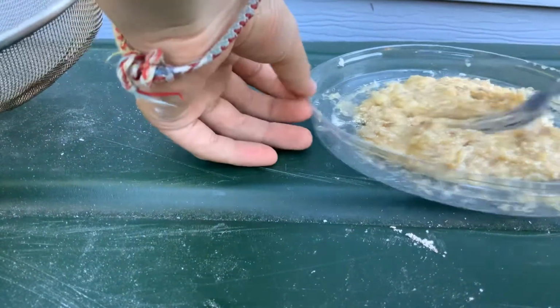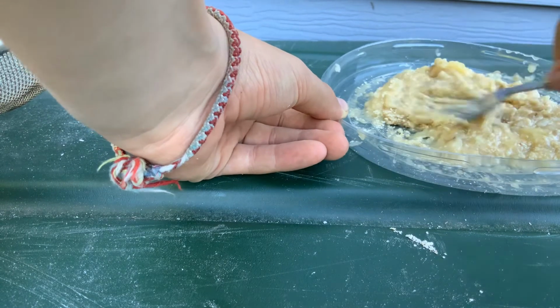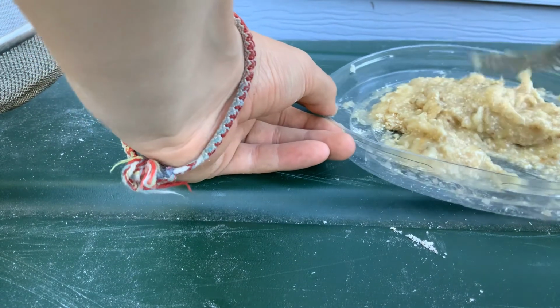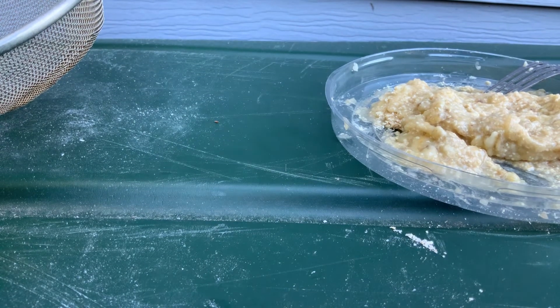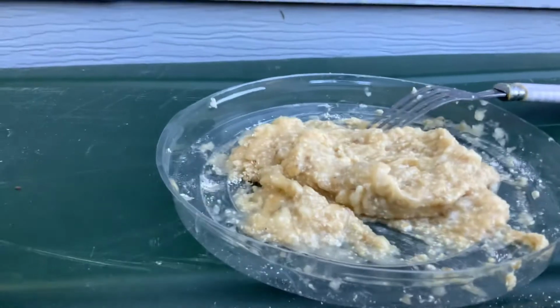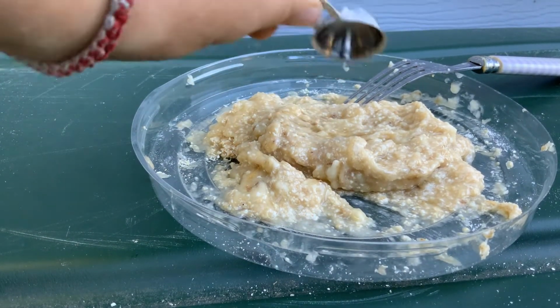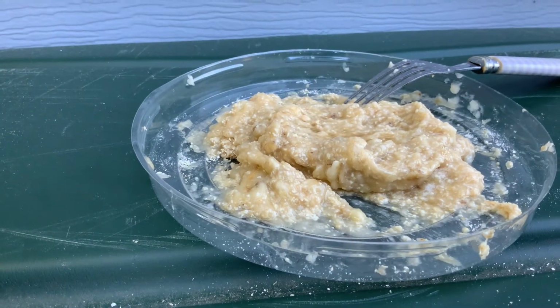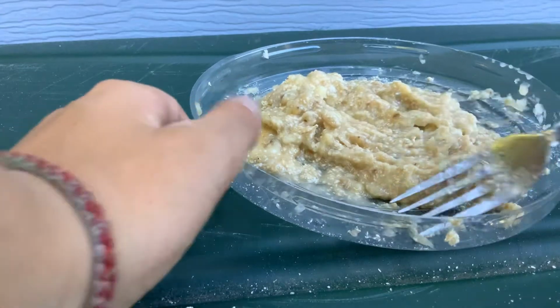All right, so I'm gonna mix this in now. It's the active ingredient in it, and I think it's to make it bigger and better. This will definitely be a lot. Great, and then here's 1/2 teaspoon of apple cider vinegar right here, and I'll just pour that. Thank you, Mom. Bye-bye. And then just mix that on in, just to keep it from molding.